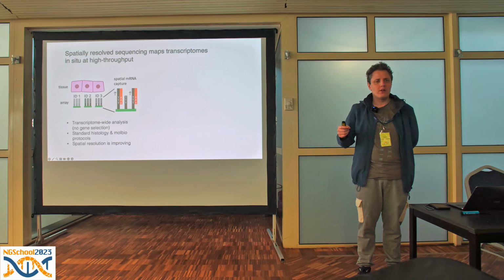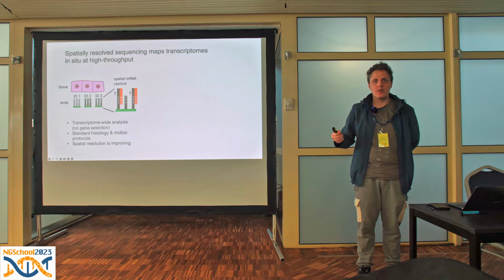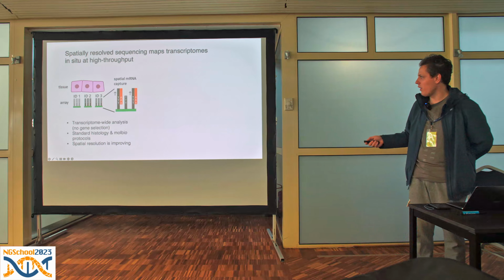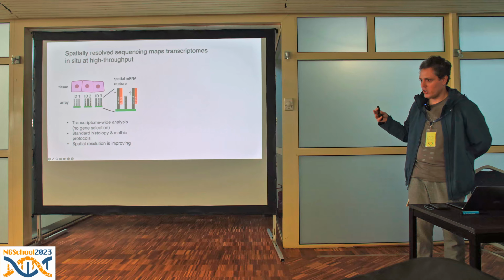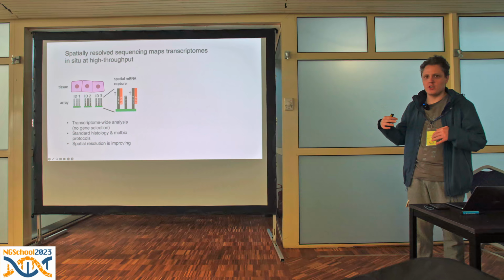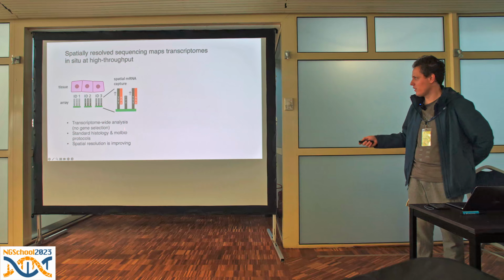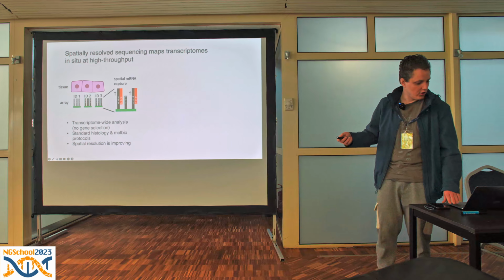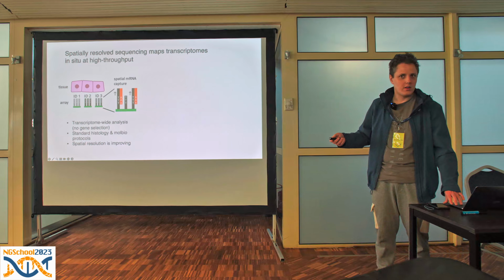There are also now new technologies arising that use fixed tissue and, rather than detecting RNA, they detect barcodes. But the main point is that you detect some material from the tissue, and you then measure how much RNA you detected by doing next generation sequencing. And when you have next generation sequencing, you can look at the sequences of the barcodes, you can look at the sequence of the reverse transcribed RNA, and you can decode which RNA was detected at which position. Hopefully that makes sense.